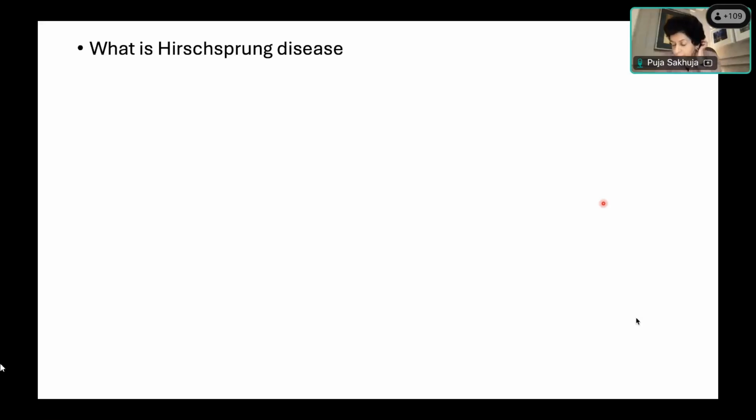Suppose they've taken out rectum and sigmoid, and this is Hirschsprung's disease involving the lower 4 or 5 centimeters. What do you expect to see grossly in the specimen? And then how will you take the sections? Anuj? Yes, ma'am.